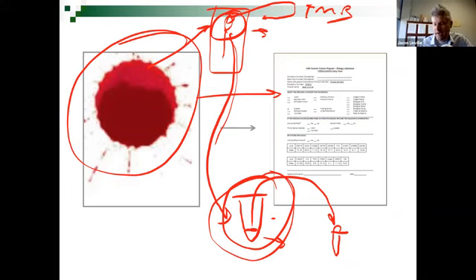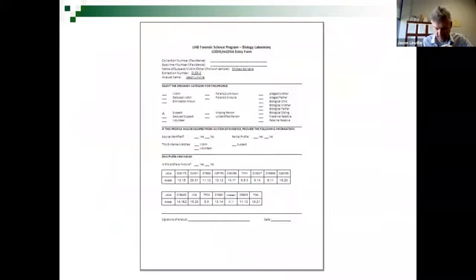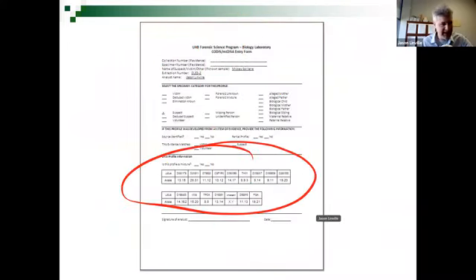And after this amplified DNA, we put it into another tube and eventually it goes into the big instrument that spits out this report. Well, spits out data that is then converted into the report. So we're still a ways from the finish line here, but amplification is what's next. Again, we're trying to get to these 13 pairs of numbers. We're going to amplify in this reaction 13 areas of DNA.